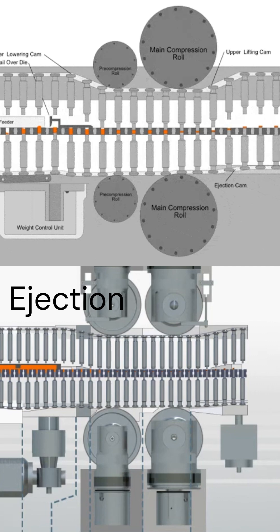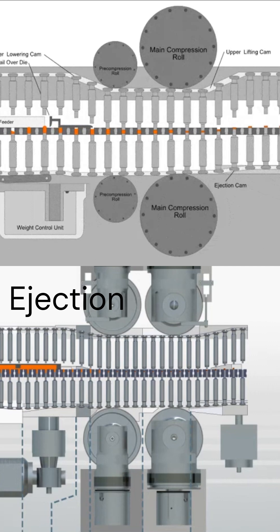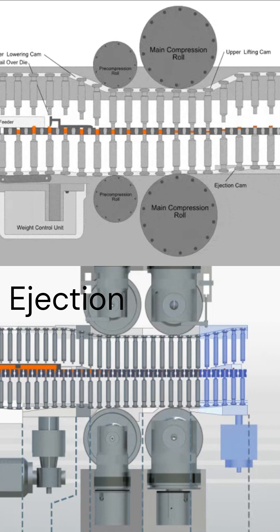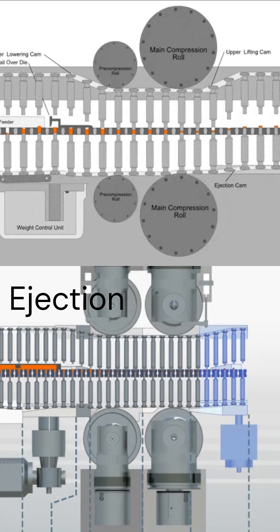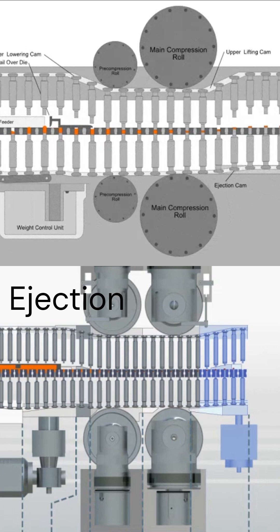At the ejection stage, the lower punch pushes the tablet out of the die. The tablet is then pushed off the punch tip by the ejection finger. At the very end, the tablet falls down the tablet chute.